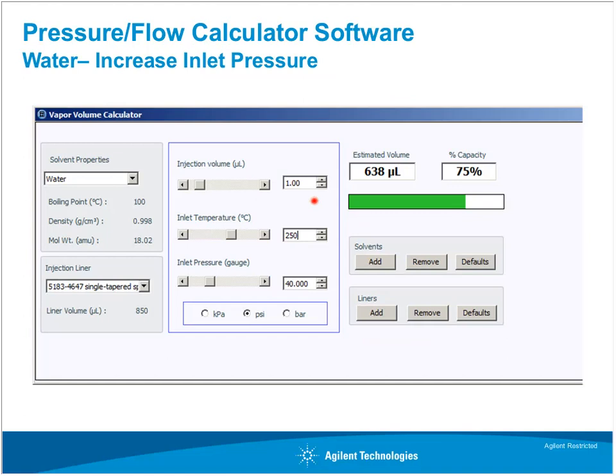what we can do is actually increase our inlet pressure. So your newer GCs with electronic pressure control have the ability to do pulsed injections. At the time of injection, if our analysis is taking 10 psi to move the carrier gas through the column at the rate that you want, we can actually increase the inlet pressure only for the time of injection, inject the sample, blanket the expansion of our solvent, get that passed onto the head of the column, and as soon as it's there, basically shut this pressure back down to 10 psi and run our analysis.